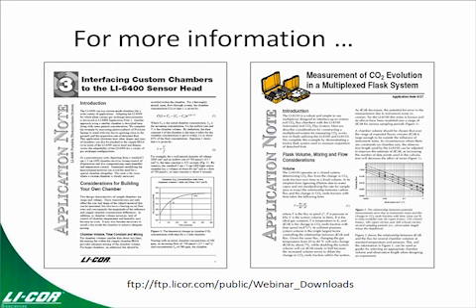Okay, our first question is, what is the biggest chamber I can use? Well, that depends on which instrument you're going to be using. On the 6400, we have a theoretical limit on the chamber, which is about 2 liters on maximum size. That's based on the flow rate of the instrument. Much larger than that, and you cannot use the pump within the instrument to control the flow rate and flushing out of the chamber. But if you think back to the example that we gave in the webinar where we had the 24 centimeter square leaf area in a 4x6 chamber, well, that chamber was much smaller than 2 liters, and we demonstrated that it wasn't practical to make that measurement with that.